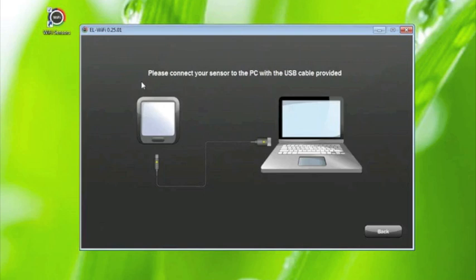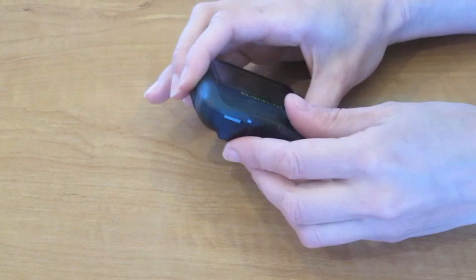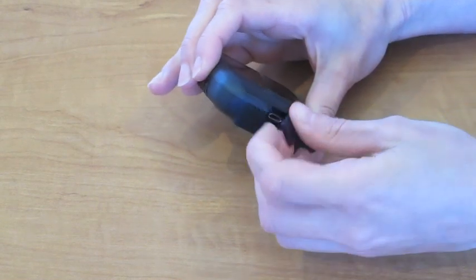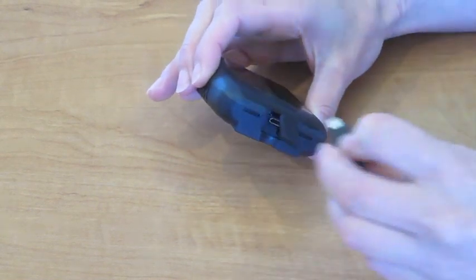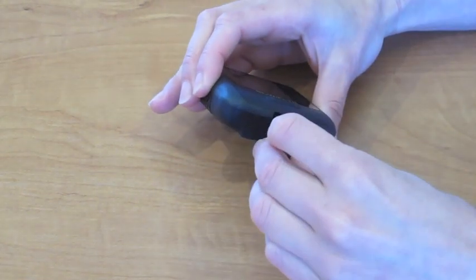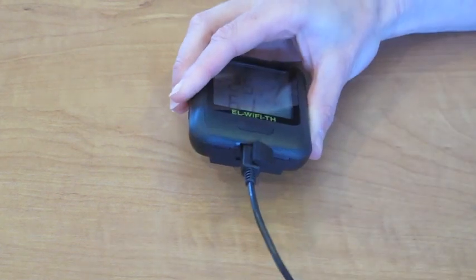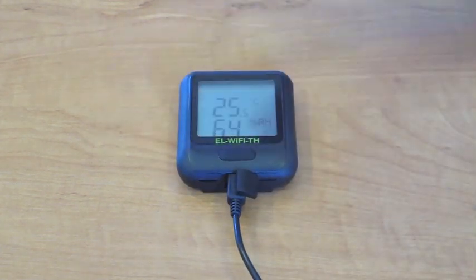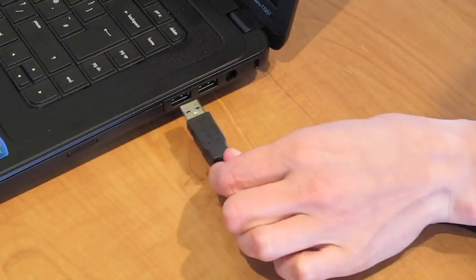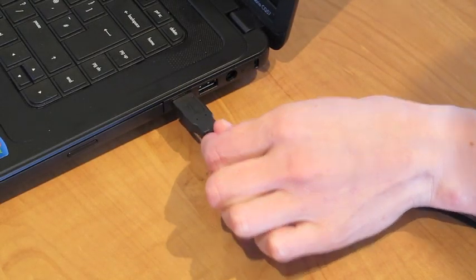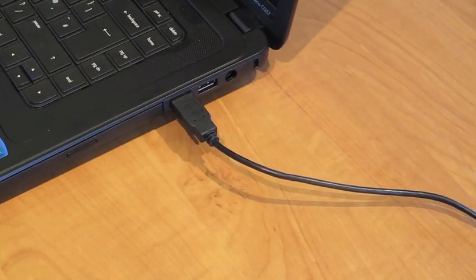Use the USB lead provided to connect your sensor to your PC. Connect the micro USB to the port on the bottom of the sensor. To access this, you will need to remove the rubber bung. Then insert the standard connector into the USB port on your PC.